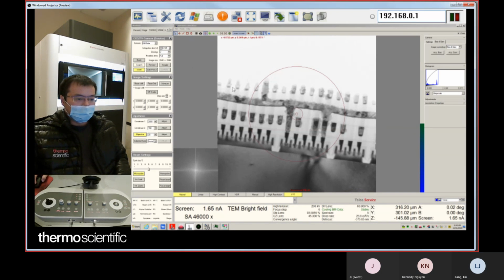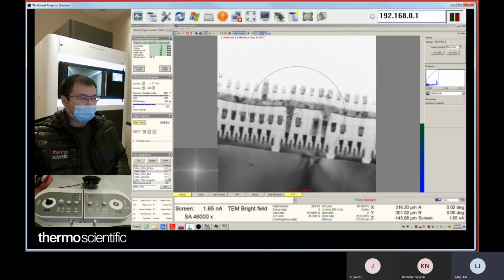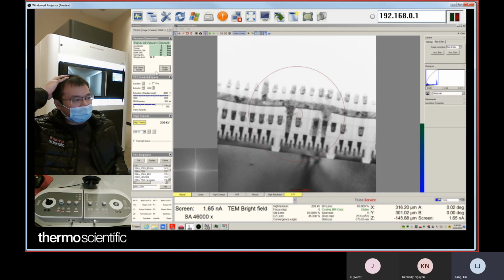You're welcome. Okay, let's take a break. I need to add a little bit more liquid here. Let's take a break, and after we're back, we're gonna do the dark field imaging. Is it okay?